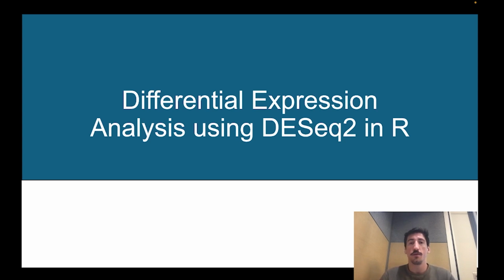Today we're going to be talking about the technique called differential expression analysis. This is a technique applied to RNA-seq datasets. Applications can include transcriptional changes after drug treatment or looking at transcriptional changes after a gene knockdown.